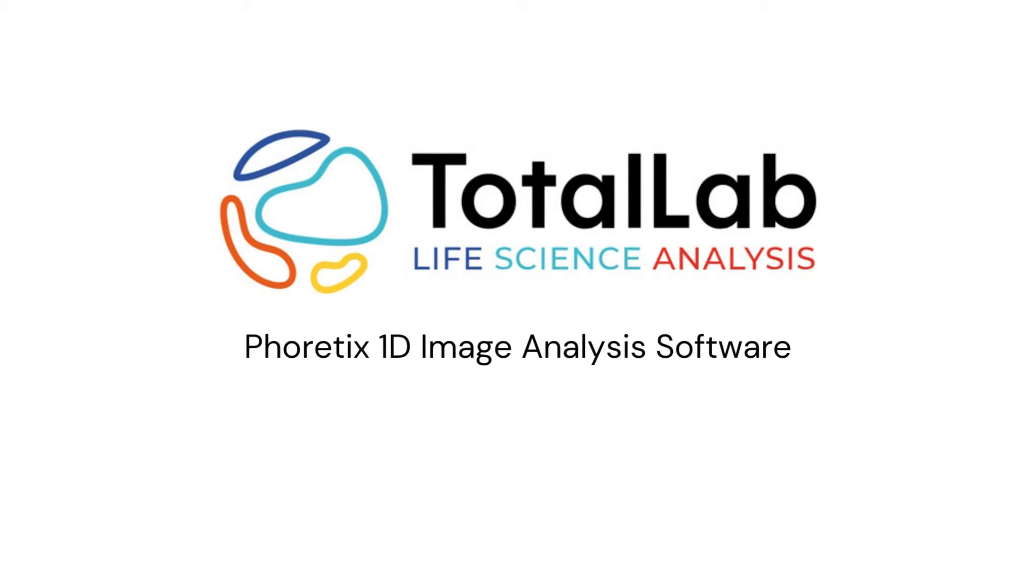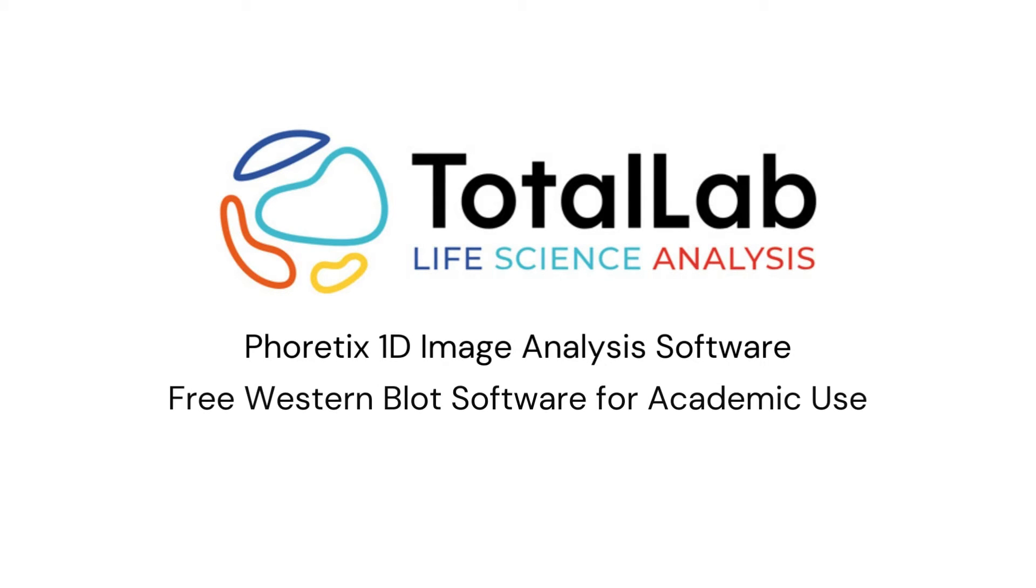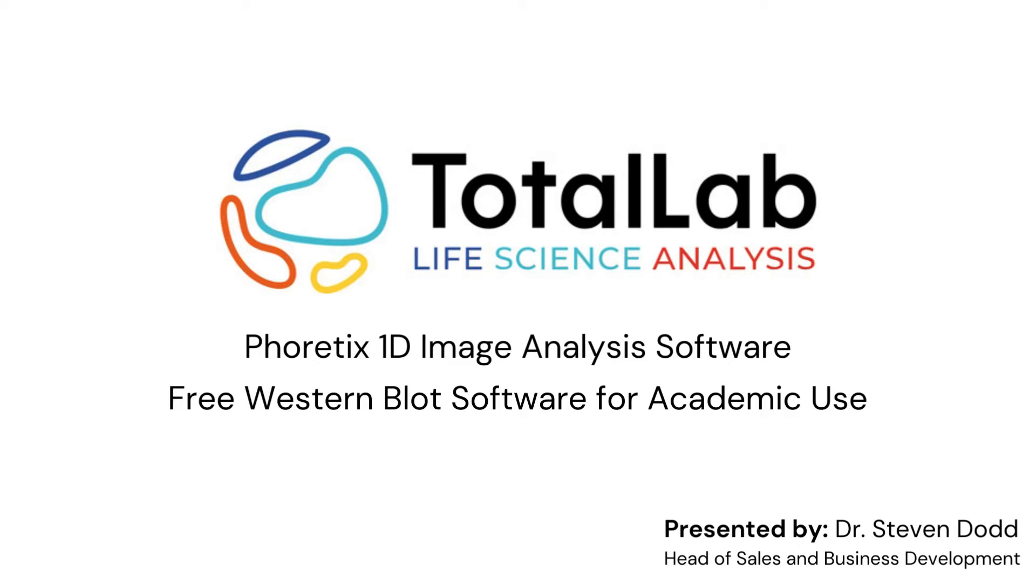Hello everyone, so today I'm going to be showing you how you can get free access to the latest in image analysis software for immunoblot and gel electrophoresis analysis for Phoretics 1D from TotalLab.